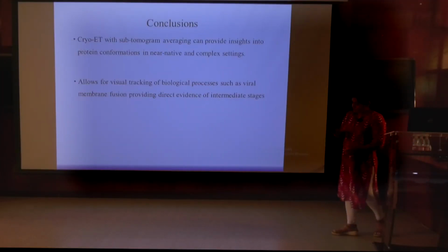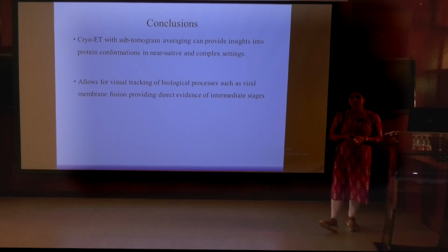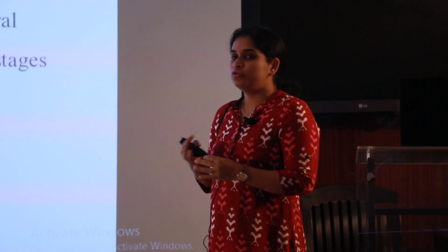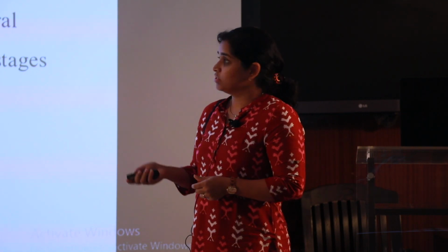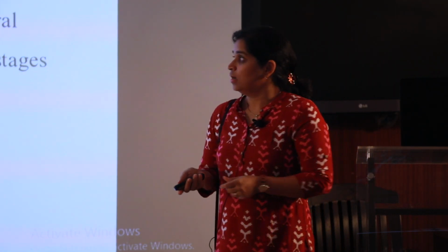And so with that, I would like to come to the conclusion of my talk: using cryo-electron tomography and sub-tomogram averaging, we can now probe more and more into the cellular context and move towards what you could call structural cell biology, where you look at a cell biology problem from a structural perspective without always having to purify the proteins or put them in an in vitro context.